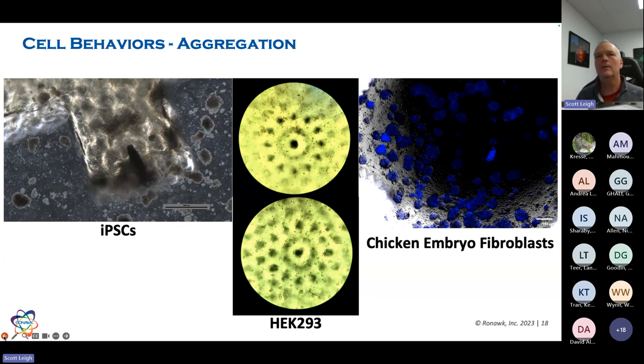Now, the first two labs that worked on this, they weren't very interested in that, they just wanted a monolayer of iPSCs. They can't do it very easily. They can't scale in 2D. So could we just do a monolayer? The third lab said, well, yeah, these are really large aggregates. What's the quality of these aggregates? This particular lab has now been growing iPSCs in the same block and collecting the aggregates over the last 2 months.